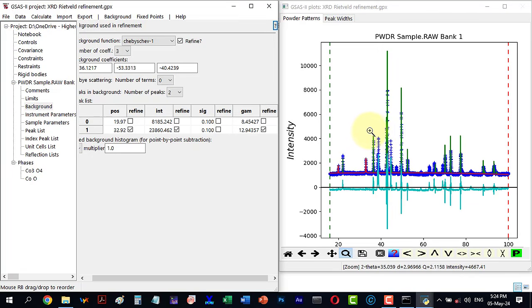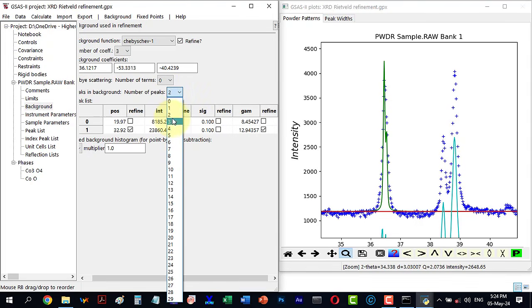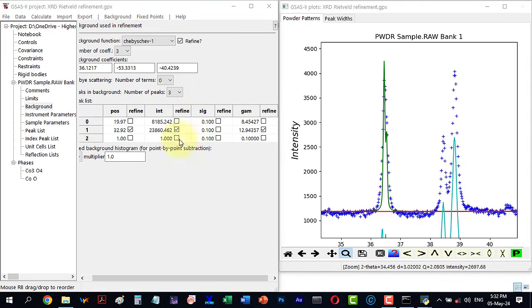Now when I look at this one, it is part of this one. However, when I examine it here, it is part of our calculated spectrum. These two peaks are from the background. I will select another peak and another peak here overall. These two peaks are from the background, so I will consider this peak first.